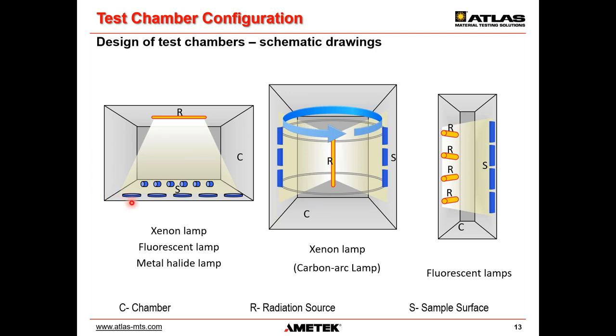That's a little bit more difficult to achieve in these static test chambers than when you have a centered light source and a rotating rack. Those rotating rack machines typically have better homogeneity from top, middle, bottom, and everywhere in the chamber regarding the irradiance level, the temperature, and the moisture as well. Simply because everything is moving and mixed regarding temperature and moisture, and the irradiance is optimized regarding lamp length and the distance to the lamp, everything is ideal.